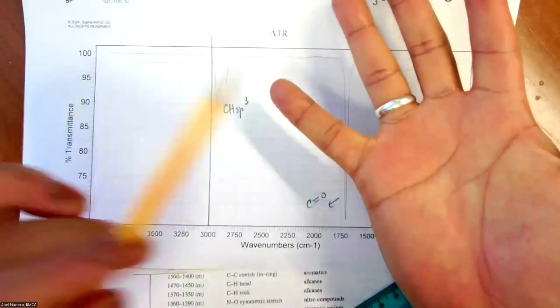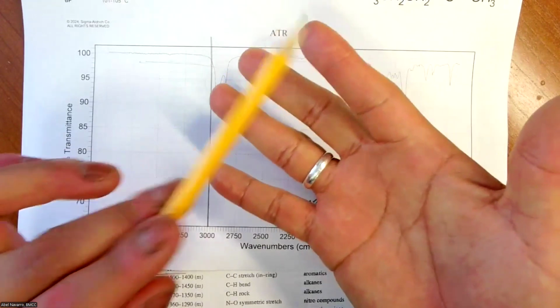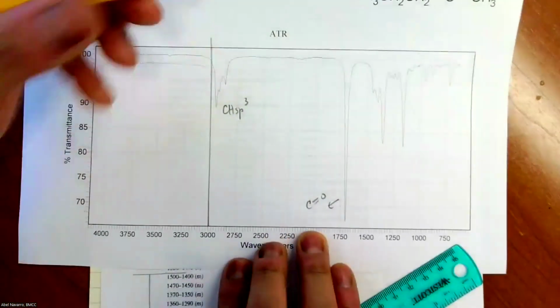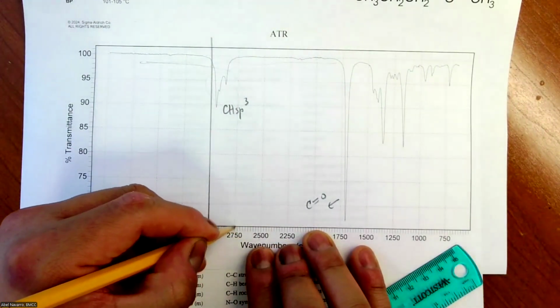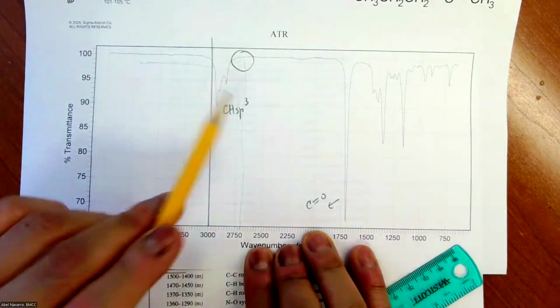Now, how do I know if it's an aldehyde, ketone, carboxylic acid, amide, or ester? It's not an aldehyde because I don't see anything around 2700. Around 2750 here, nothing.